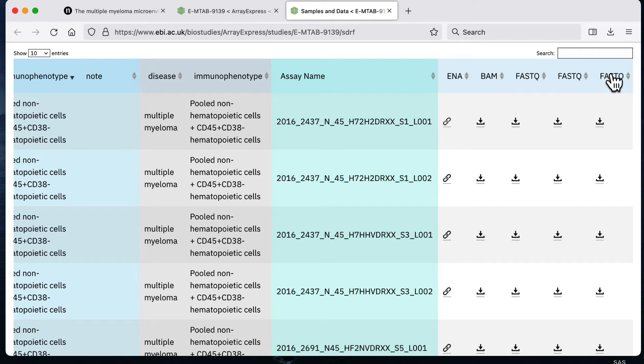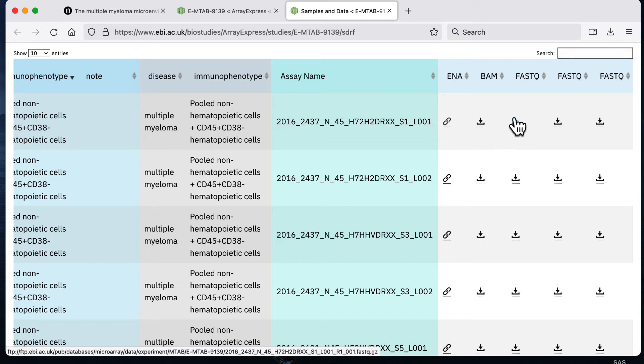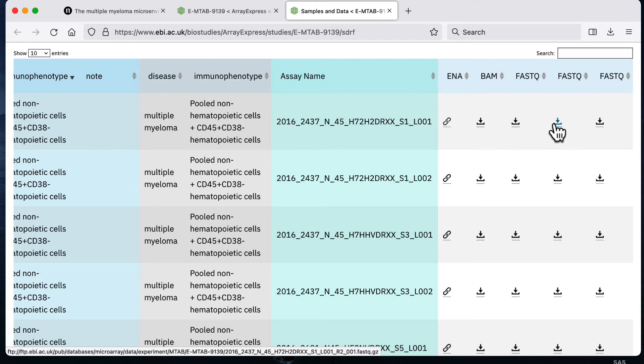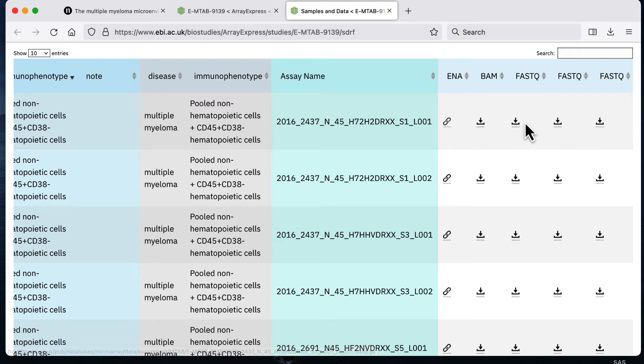These three FASTQ columns, when I hover over the little download icon, this one refers to the read one or R1 file, this one refers to the R2 or read two file, and this one refers to the index read file or I1 file. There are these three files for lane one and then these three files for lane two.